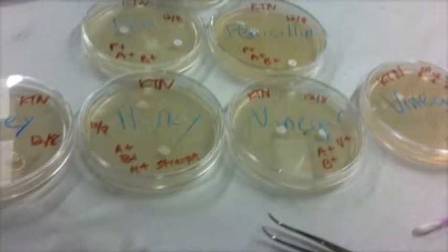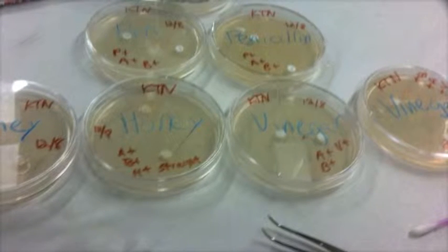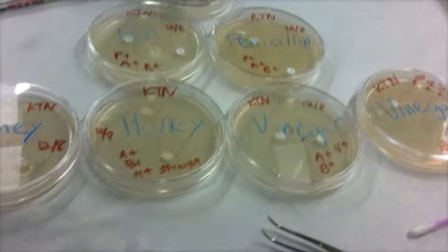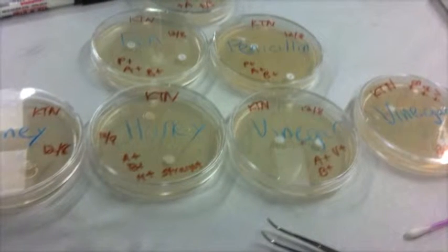The first thing we had to do to set up this experiment was fill 6 petri dishes with agar. Agar is a gelatinous substance derived from seaweed. The gelling agent is an unbranched polysaccharide obtained from the cell walls of some species of red algae.